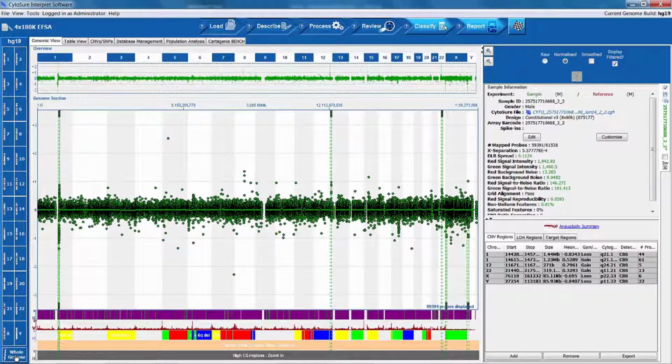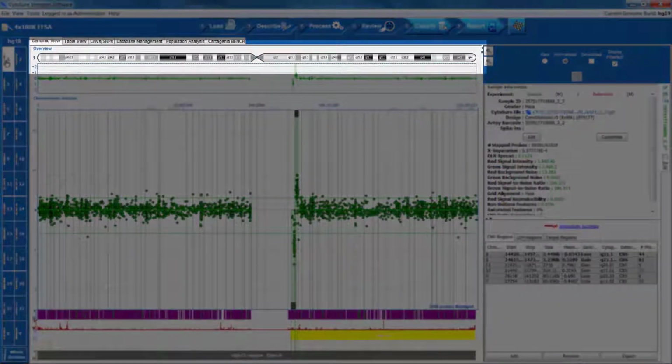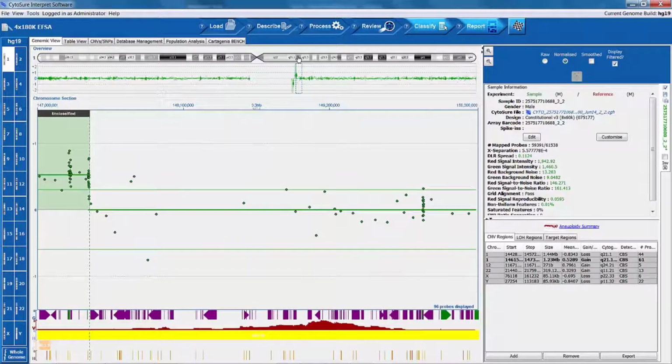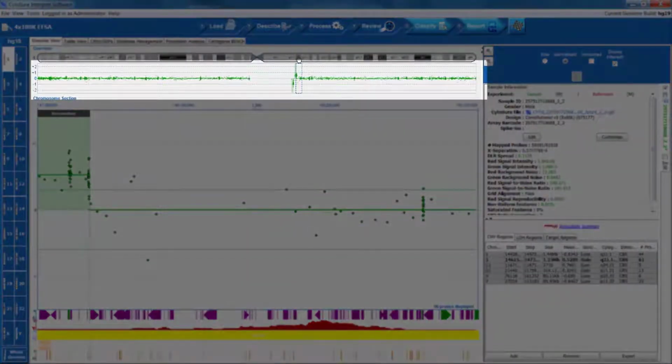When an individual chromosome is selected, the ideogram is displayed at the top of the screen, and you can click on the banding patterns in the ideogram to zoom in directly to that region. Just below the ideogram is a plot of the data in the Chromosome Overview panel.